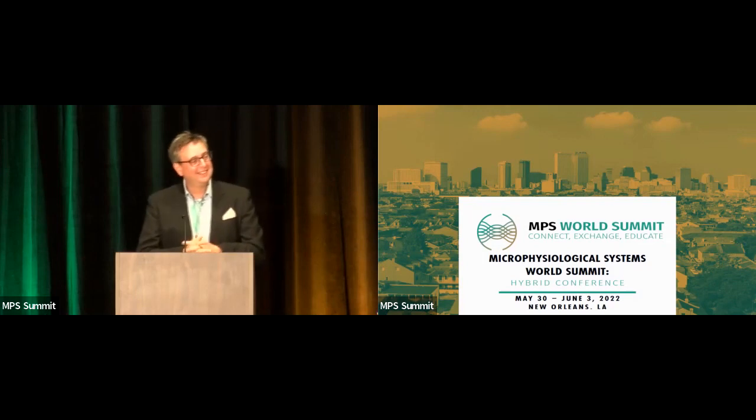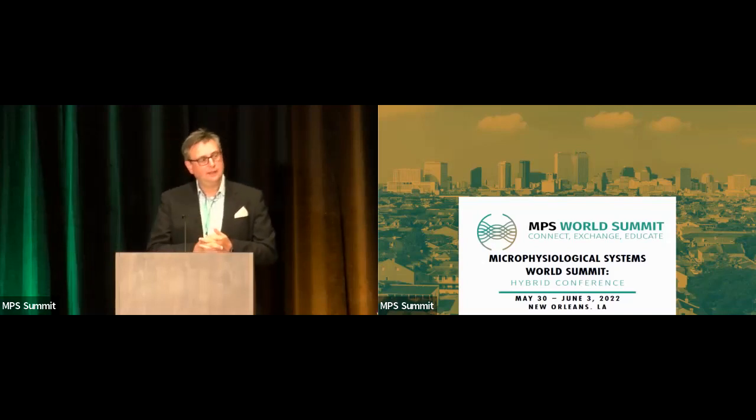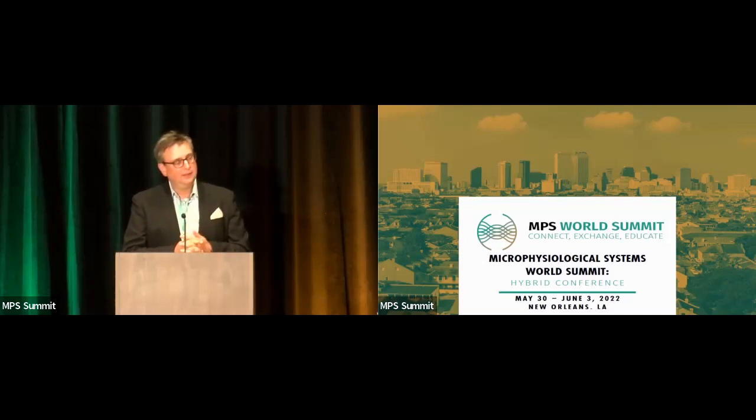Jan, very nice talk. Thank you. Are you able to control the oxygen tension in your plates? And what is the oxygen tension? And does it relate more to zone 1 or zone 3? Because there are differences.